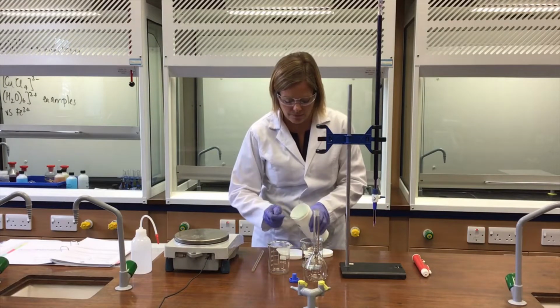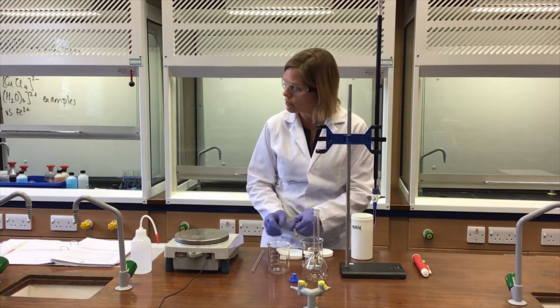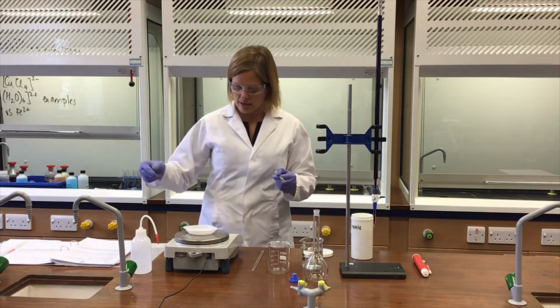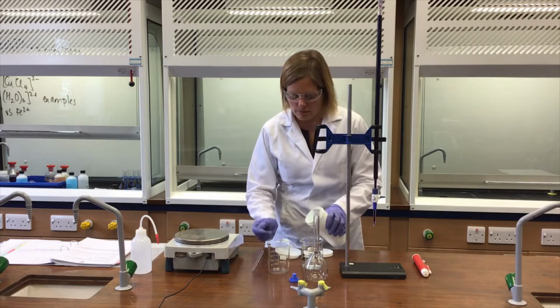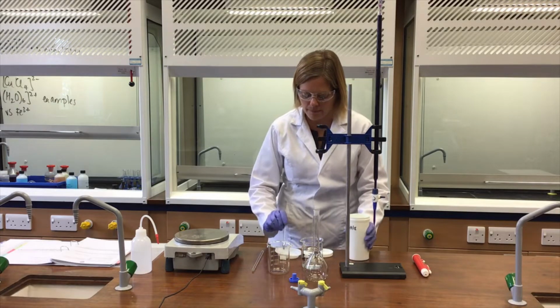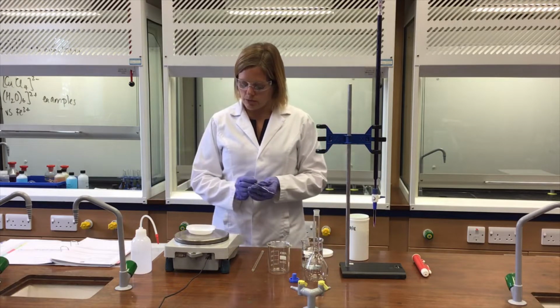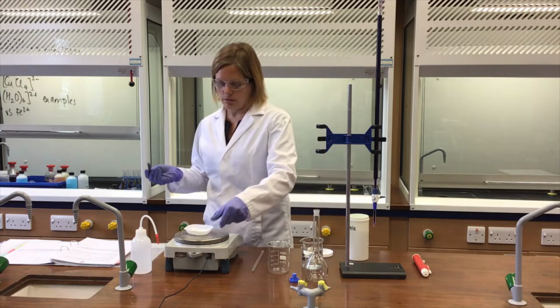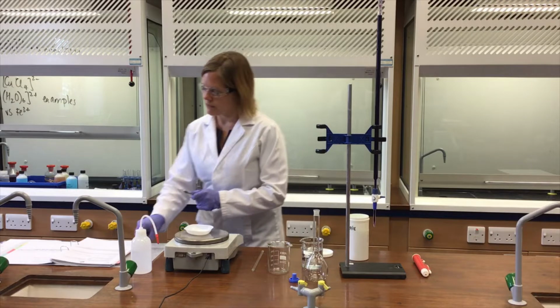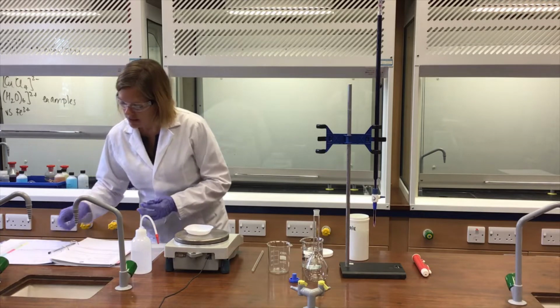So, 1, 2, and 3, so I'm aiming for about 12.75-ish, maybe a little bit less. It's 11.06, another, see how I go. That's a little bit too much this time, so I'll take a bit of that off. And we're at 12.77 grams, which is perfect, that's well within the range. So 12.77 plus or minus 0.01 grams there.